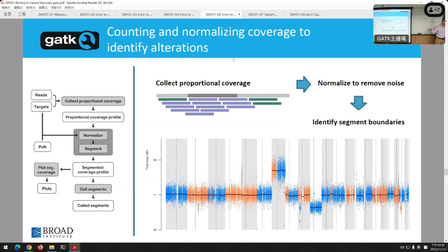So when we talk about both cancer and germline CNV calling, it's very difficult because there's a lot of inconsistency across the depths, the amount of sequencing you see in any one exon, even within a gene. Okay? And some of the events are big and some are small, and some of them are germline. It's very hard to tell what is signal and what is just this exon doesn't capture well.